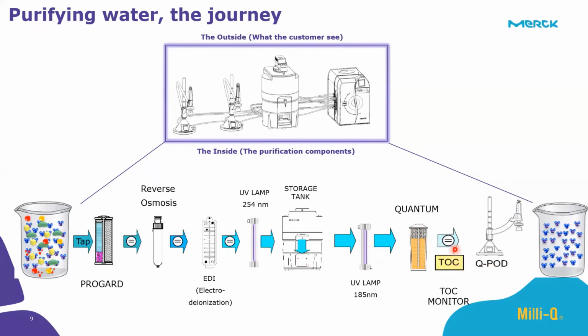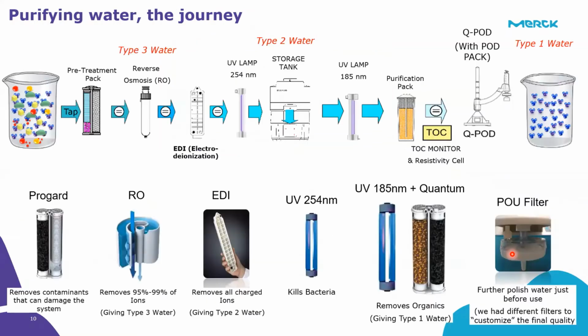You also have monitoring technologies at every step to make sure that you're able to know the performance of your water purification system. So this just shows, trying to remove this to unpin it. Okay, this just shows the steps really defined.